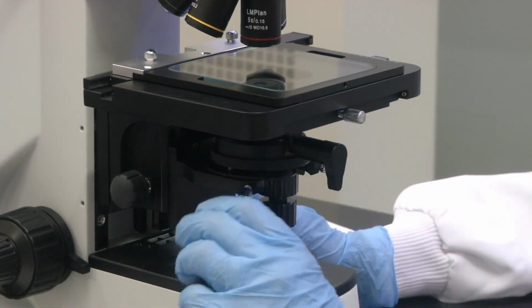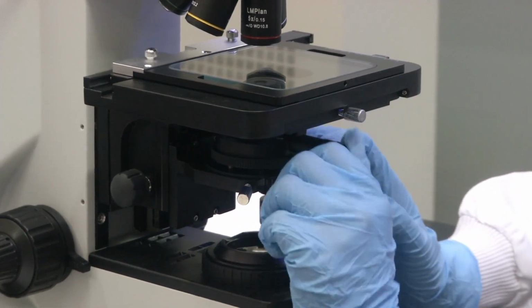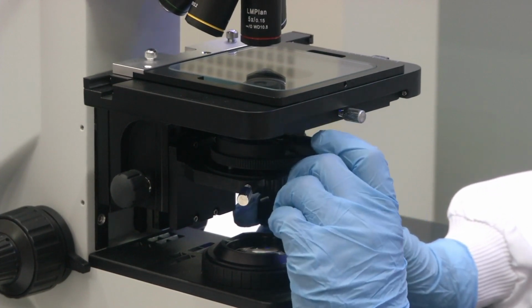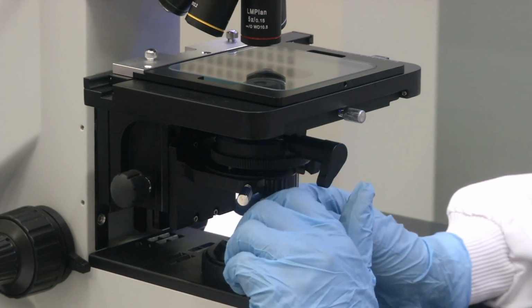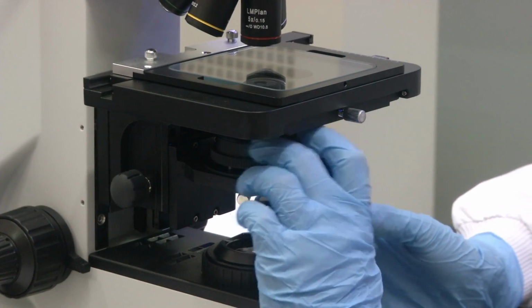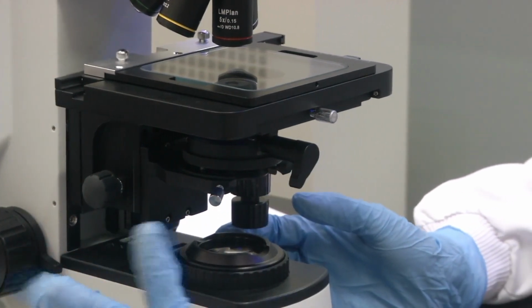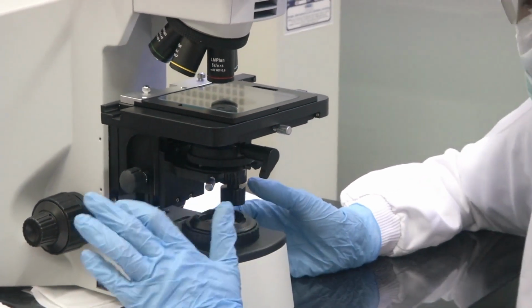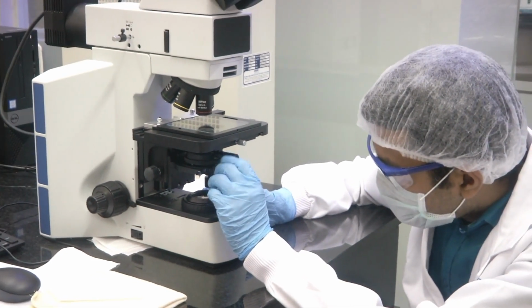Next, we have a few knobs that are below the stage. These are used for aperture adjustment. Generally in photography, or let us say microscopy also, there are a few things that you look at. Photography enthusiasts among you might know there is aperture, there is exposure time, there is something called the f number, that measures the focal length at which you are capturing the images and all. Similar concepts apply to microscopy as well. So depending on how much aperture you want.